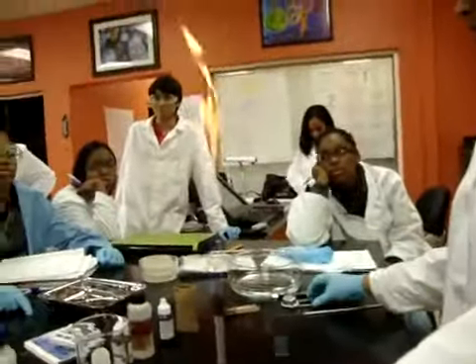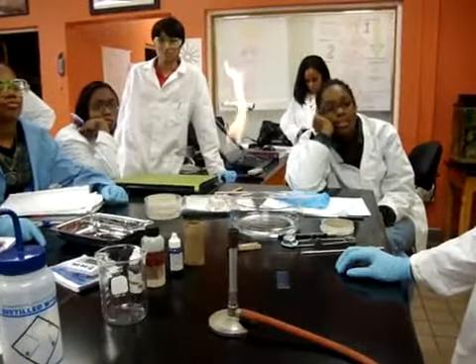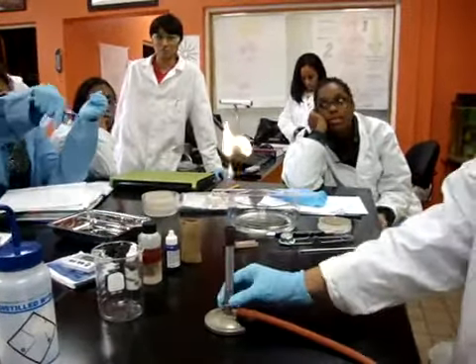Make sure you have a flame that you can control, so we don't need it to be this big. Hair is pulled back and you have on your safety glasses.